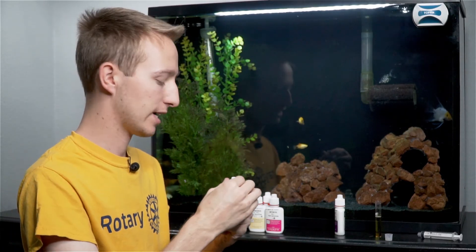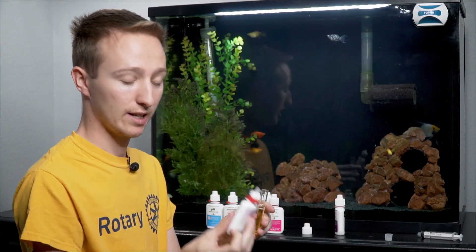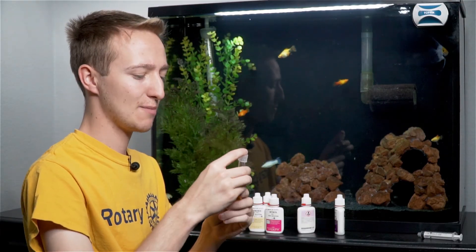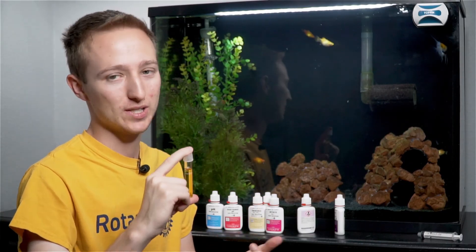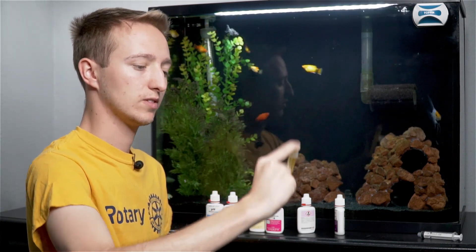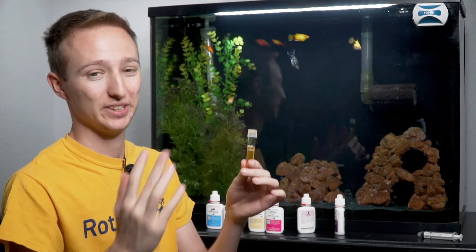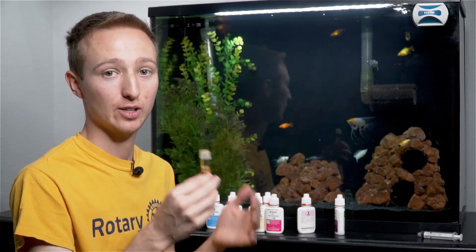So now that you've got bottle number two shaken for 30 seconds, go ahead and take the cap off, grab your test tube that already has bottle number one in it, and add 10 drops. Now cap the test tube and vigorously shake it for 60 seconds — a full minute. This one always has some water come out, but that's what the test needs. You really need to shake this one or else it's not going to work. And 60 seconds — done. It'll slip out of the cap a little bit; that's normal and expected. This one also has a five minute timer, so set another timer.